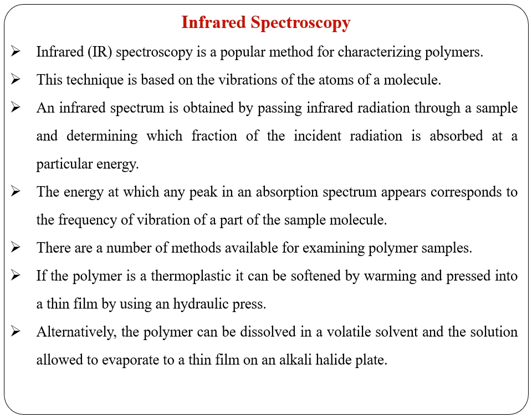Infrared spectroscopy is a very popular method for characterizing polymers. This technique is based on the vibrations of the atoms of a molecule. An infrared spectrum is obtained by passing infrared radiation through a sample and determining which fraction of the incident radiation is absorbed at a particular energy.